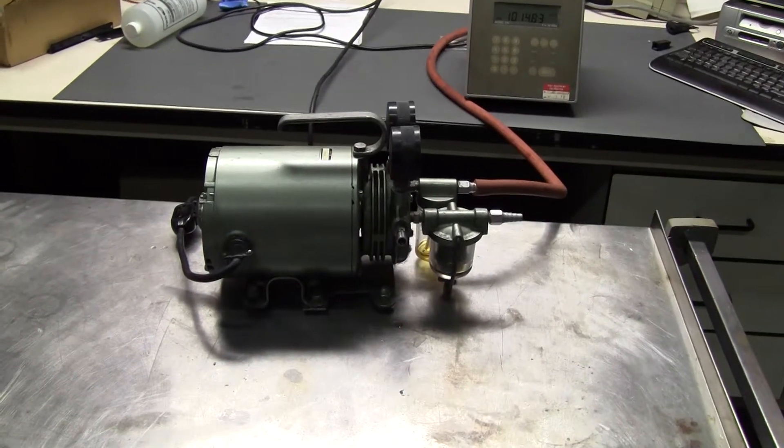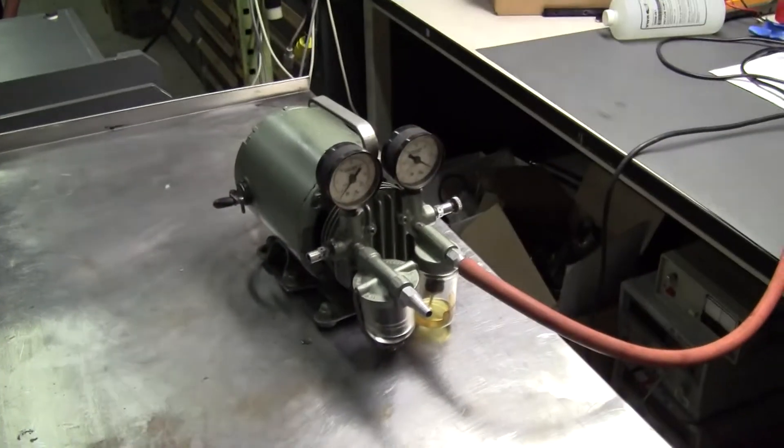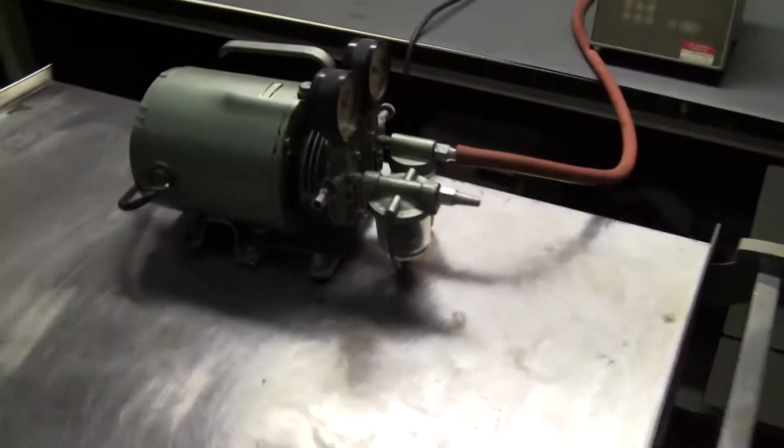Hi, this is Cody Young from Hi-Tech Trader. Today we're looking at a Gast 1/6 horsepower rotary vane vacuum pump. Nice and clean.